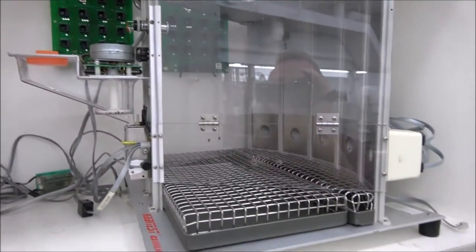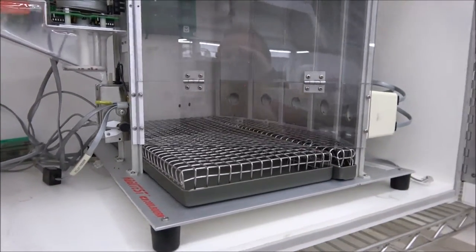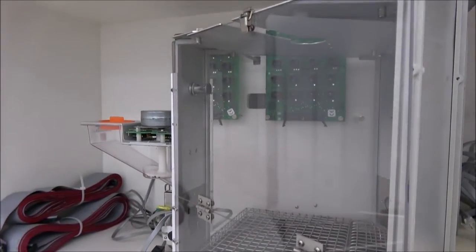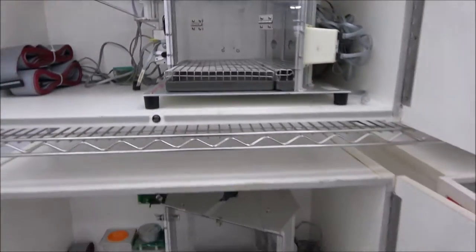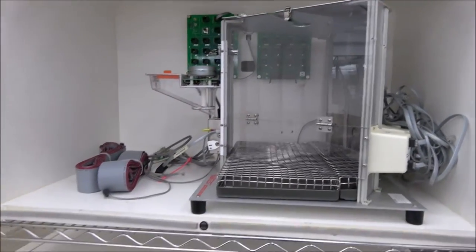You can kind of see back here we have five head closets, and I'm going to show you a little bit closer on the one where we have the door open. But I just want to go through each cabinet so you can see that each one is identical and intact.